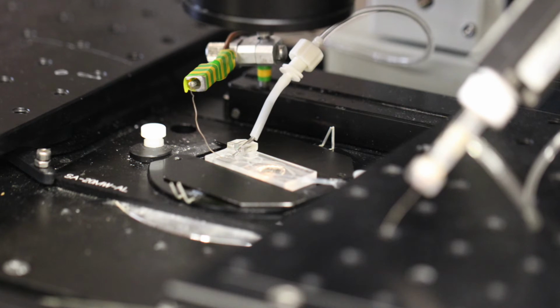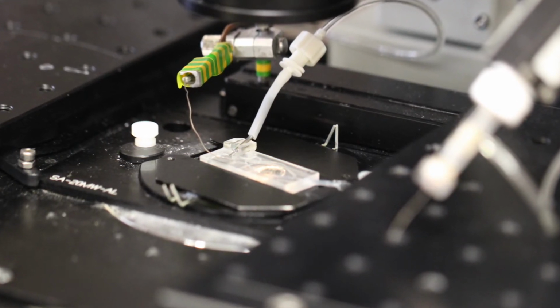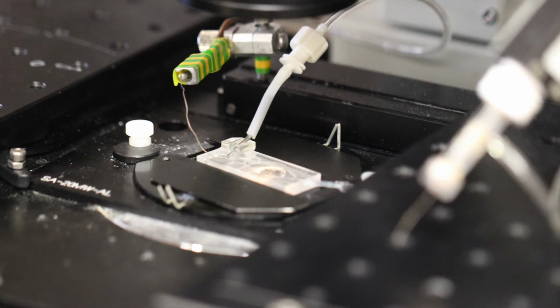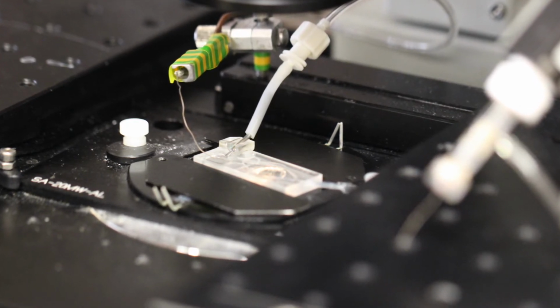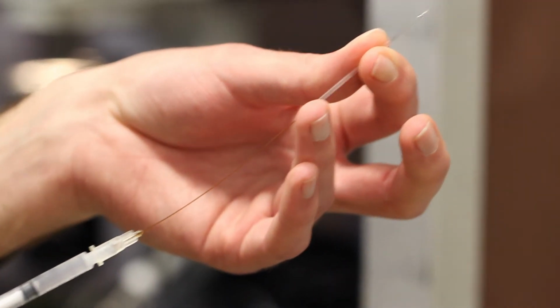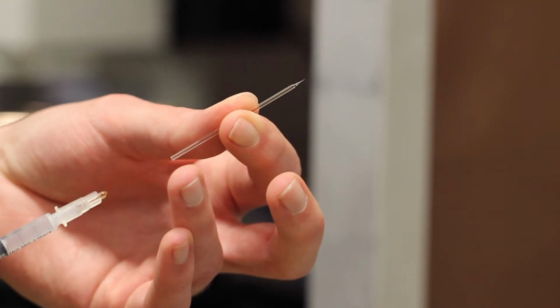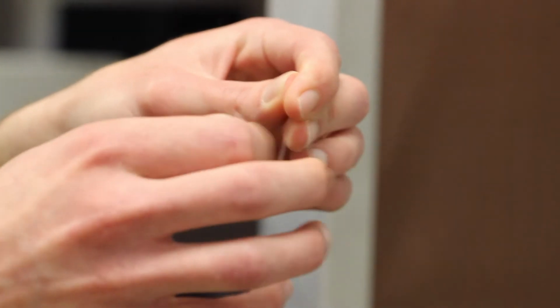The experiment is monitored in a Faraday cage to avoid electric noises. The micropipette is a glass capillary which is stretched by heat until it breaks, and then the tip is polished by heat too. The capillary is filled with a solution that contains gramicidin, an antibiotic that will make pores in the plasma membrane, to perform the perforated patch clamp configuration. The gramicidin is only permeable to sodium, potassium, lithium, and cesium, so it allows a certain selectivity.